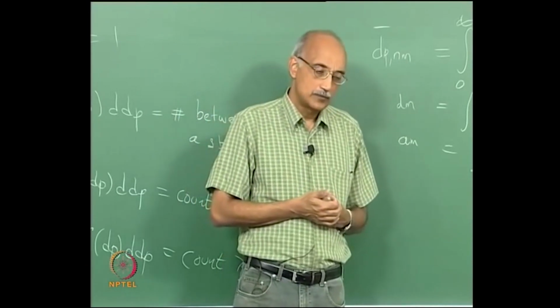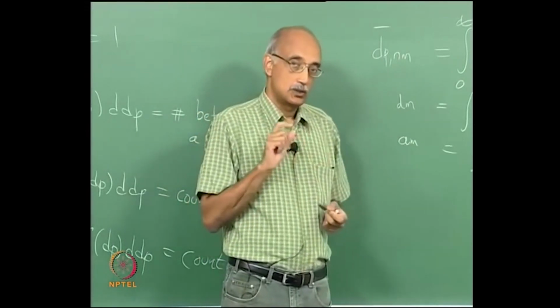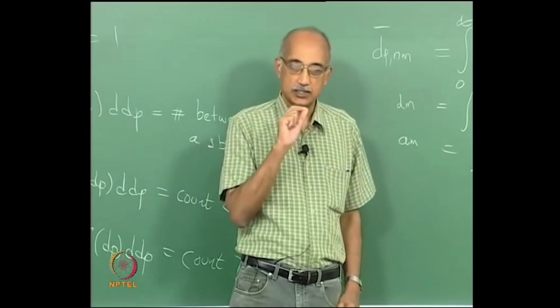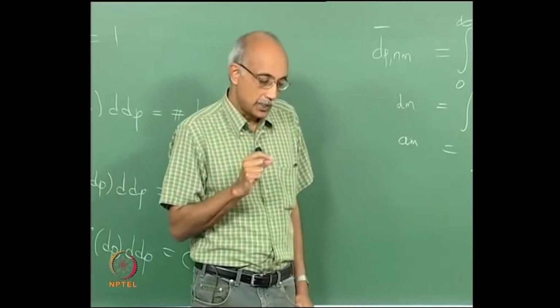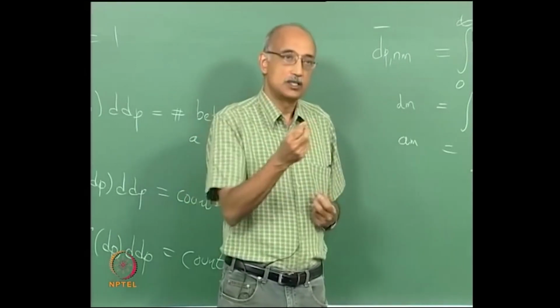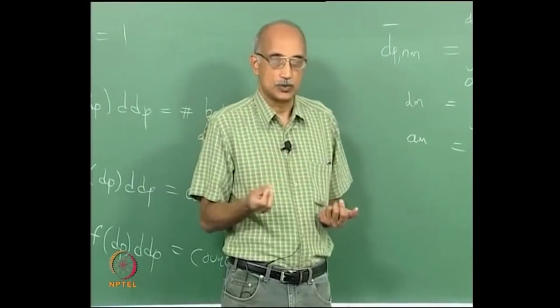So acoustic scattering is a technique which is superior to light scattering for concentrated suspensions, because unlike light scattering, which essentially requires a single particle interaction with the light source, in acoustic scattering you can actually transmit the sound wave through a concentrated slurry of particles, and you can still deconvolute the phenomena that are going on sufficiently so that you can still establish a particle size distribution.